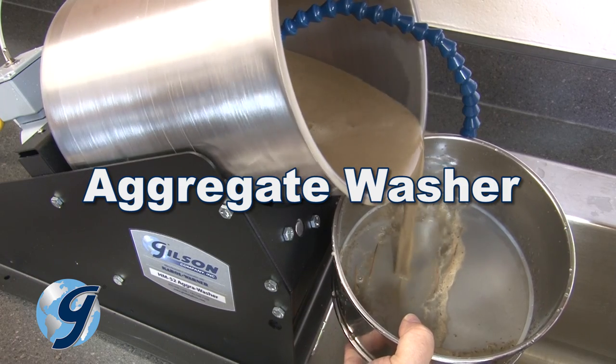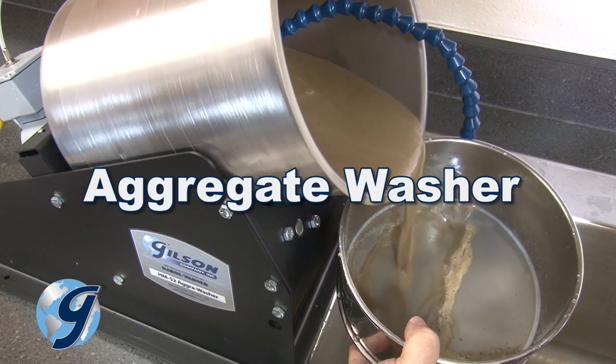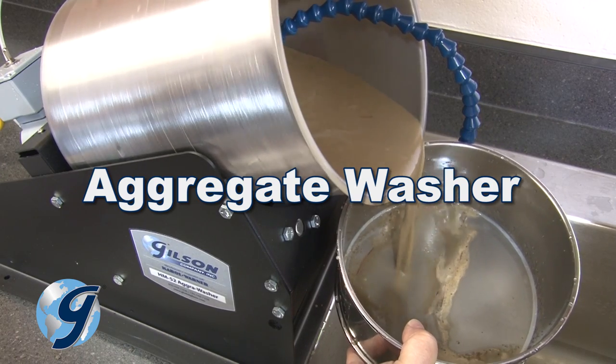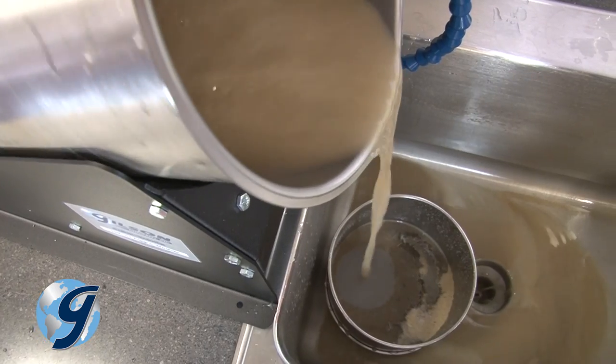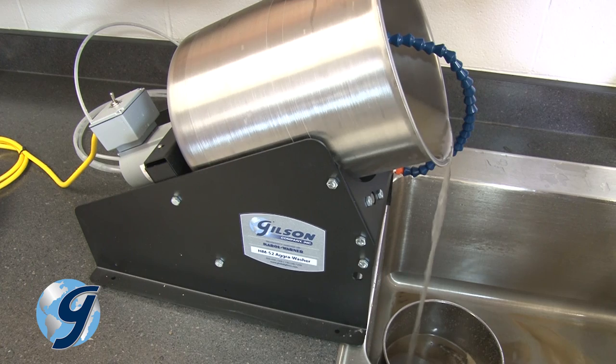The aggregate washer mechanizes this process, saving time and increasing repeatability. Runoff can be filtered with a wet wash or standard sieve positioned near a drain or fitted with a drain pan.